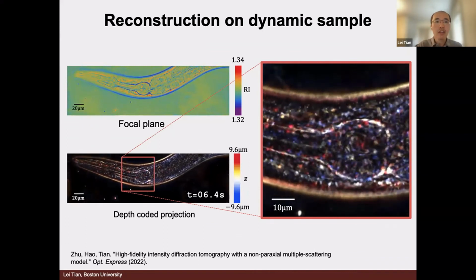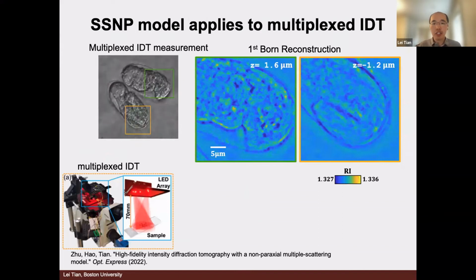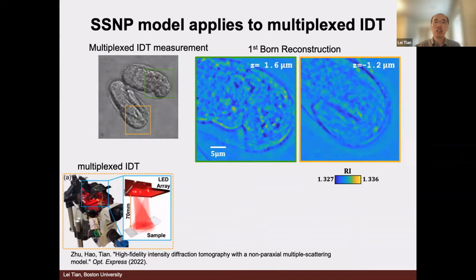So the nice thing about this particular algorithm, although I didn't go into too much detail, I highly recommend reading the details. In reality, when we build this algorithm for the reconstructions, we actually consider both the sequential model, when we're turning on one LED at a time, and this multiplex model in a single holistic framework. So what that means is when you do the reconstructions, you can derive a single algorithm, regardless of whether it's sequential measurement or multiplex measurements.